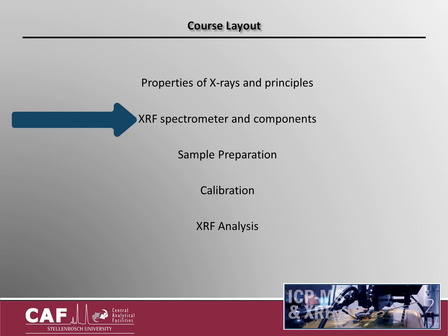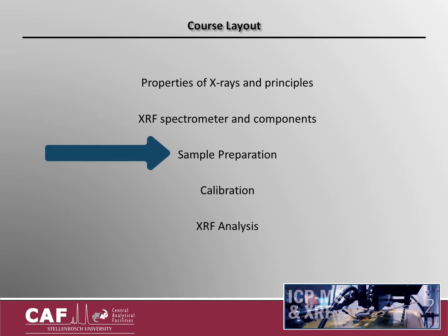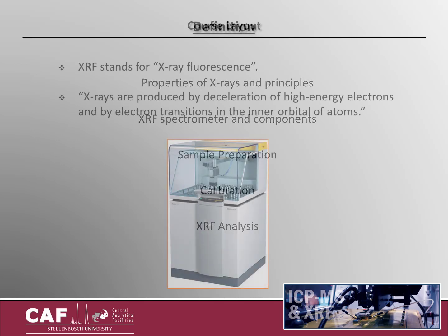Each component has to function under specific parameters to provide the best analytical results. Sample preparation will be briefly discussed. More details into this topic can be found in our sample prep course for ICP and XRF analysis. After the instrumentation parameters are discussed, we will end the session with calibration setup and analysis.